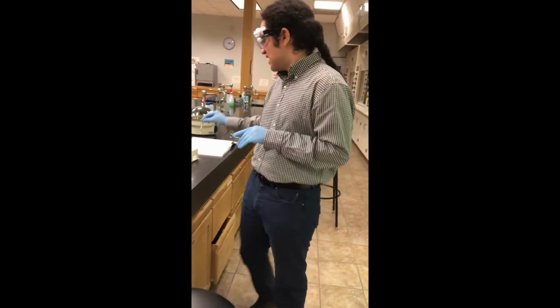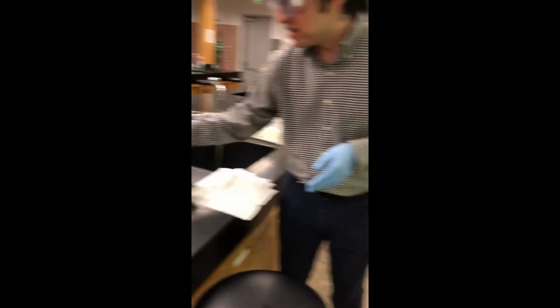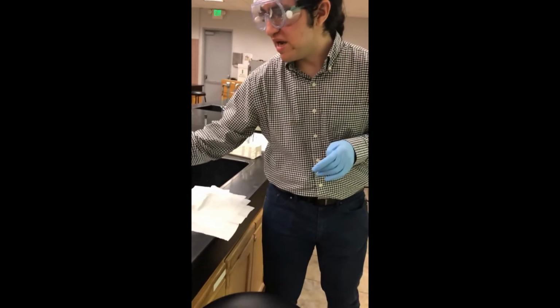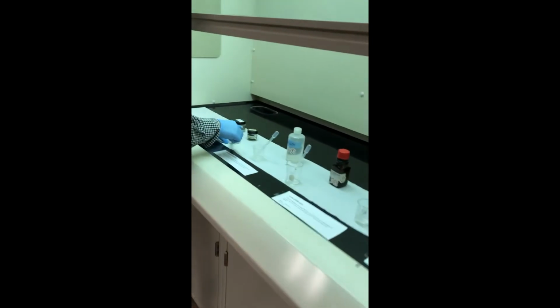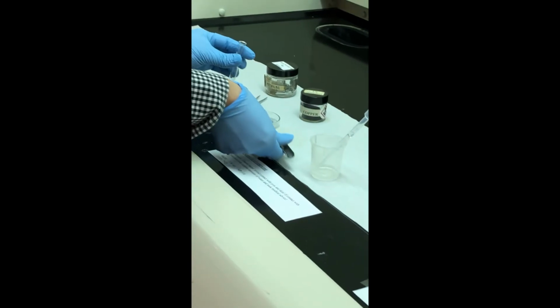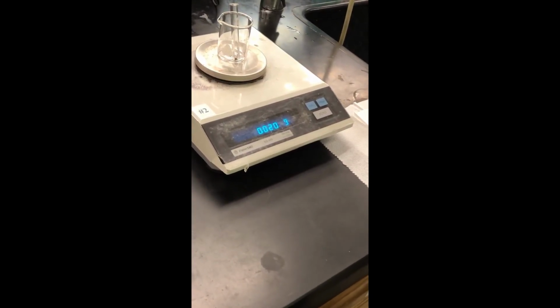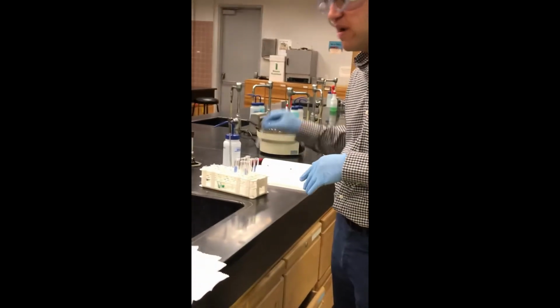Now we are to dispense less than 0.02 grams of copper. So what we're going to do, just as my little trick, I'm going to tare this empty test tube in our beaker, and I'm going to transfer copper, and I'm going to make sure my mass is less than 0.02 grams. Okay, so just as a check, right on the dot. So this is the mass of copper for test tube 1. Let's repeat this process for test tubes 2 and 3.